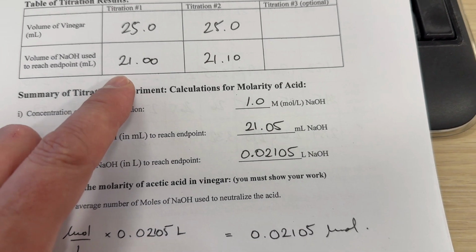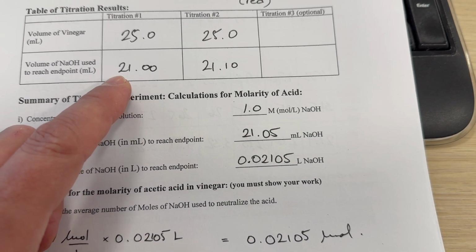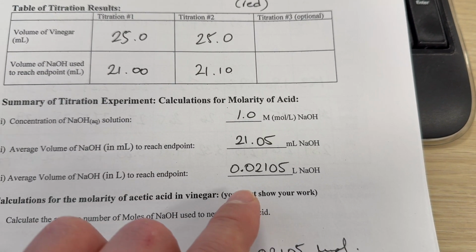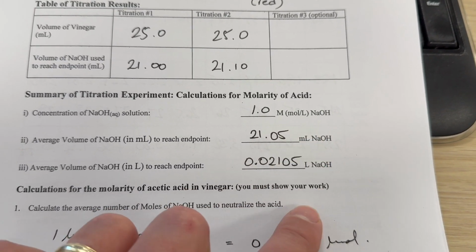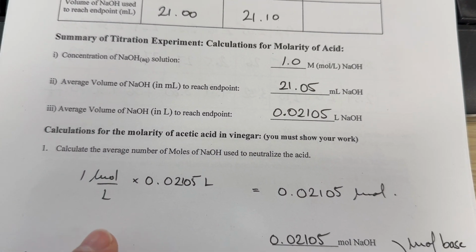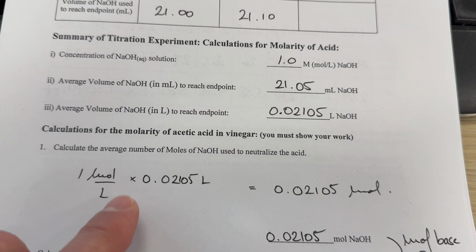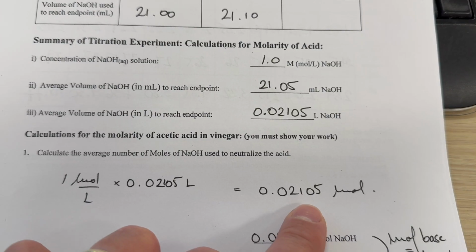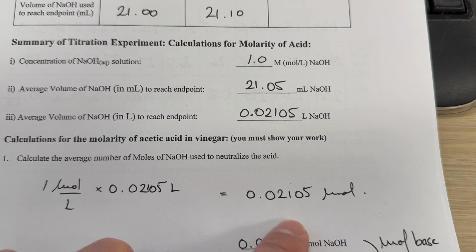So we take the milliliters and divide by 1,000, because there are 1,000 milliliters in a liter, and the concentration is in moles per liter. So 1 mole per liter multiplied by 0.02105 of course gives us 0.02105 moles.